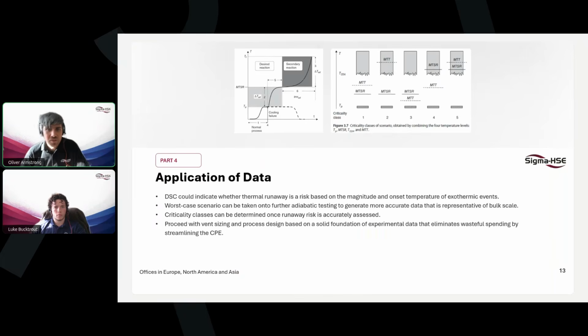We can then also integrate the boiling point analysis that we may have done with DSC into this assessment to assign a criticality class to the intended reaction.